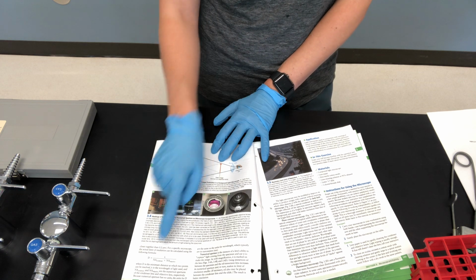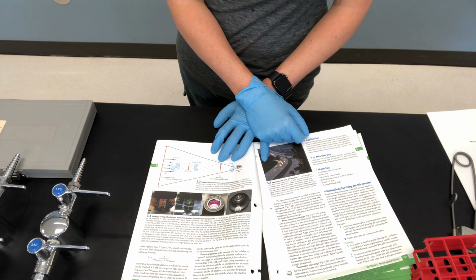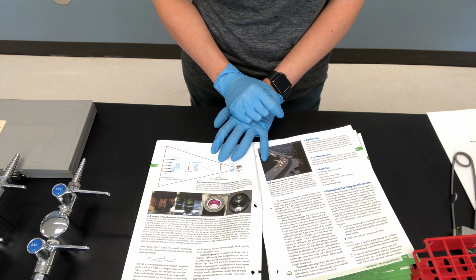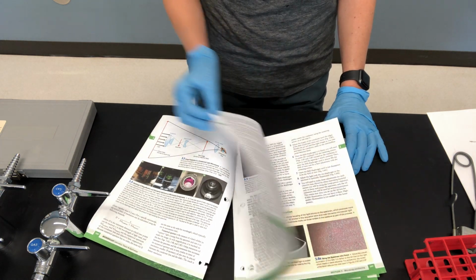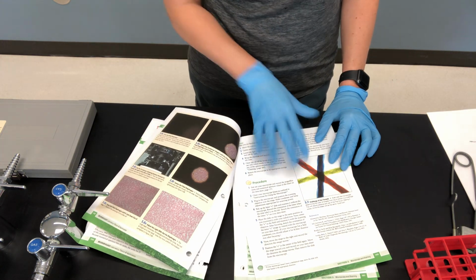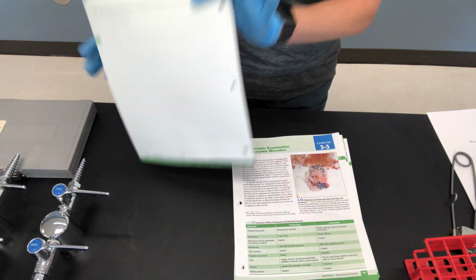I'm not too concerned about the math that goes along with numerical aperture. You need to be able to determine the total magnification, which is the multiplication of the eyepiece magnification and the objective lens magnification. I'll go through that when I give you the tour of the microscope here in a second. So 3.1 just introduces basically how to use a microscope. So if you've never used one before, if it's been a while, you can read through that. We're not doing the blood slide or the threads. That was kind of general bio stuff. So it just has more informational for you.